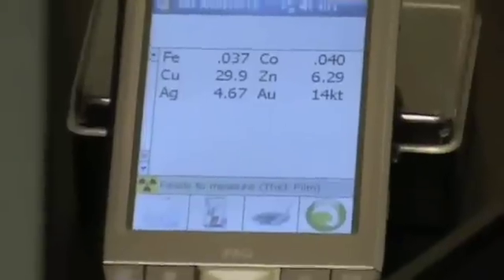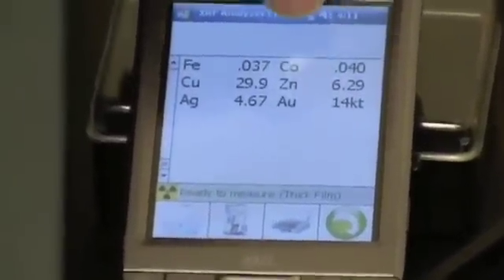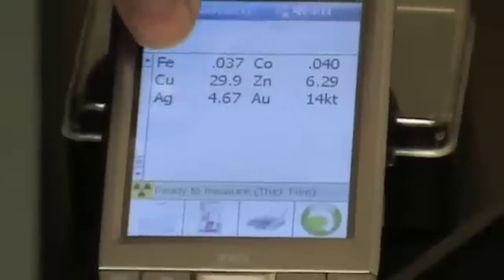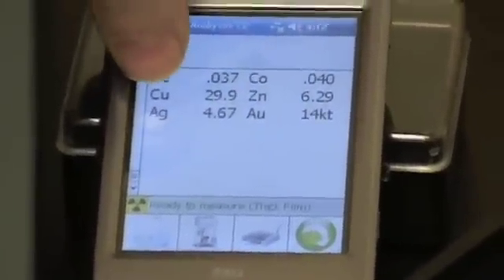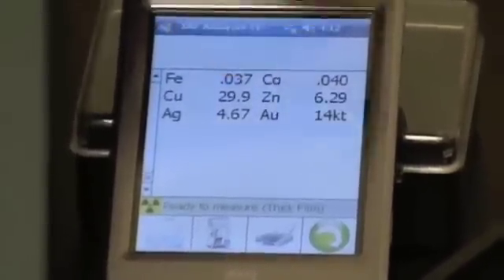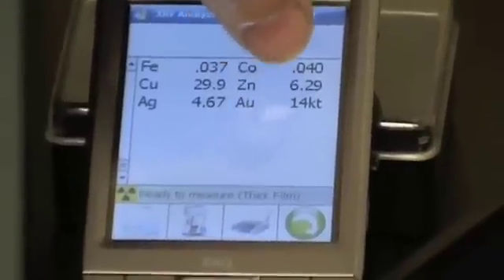So in testing this item you can see it has just a touch of iron, a little bit of cobalt, 29.9% is copper, 6.29% zinc, silver is just under 5% at 4.67%, and this is testing out at gold which is AU at 14 carat.